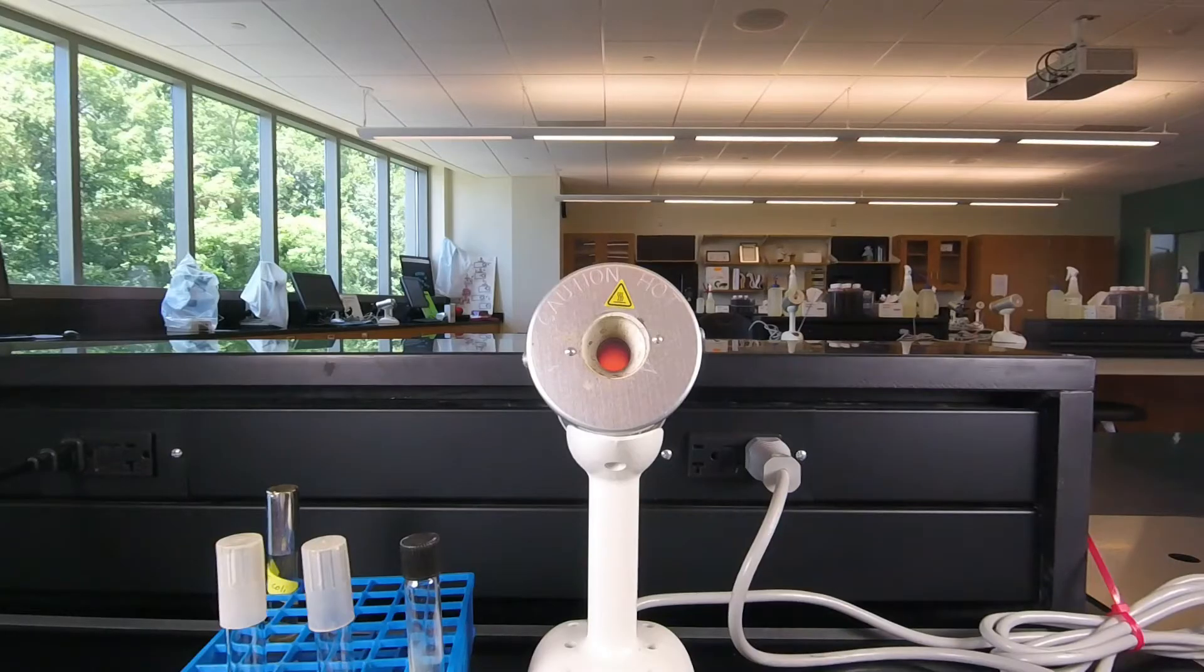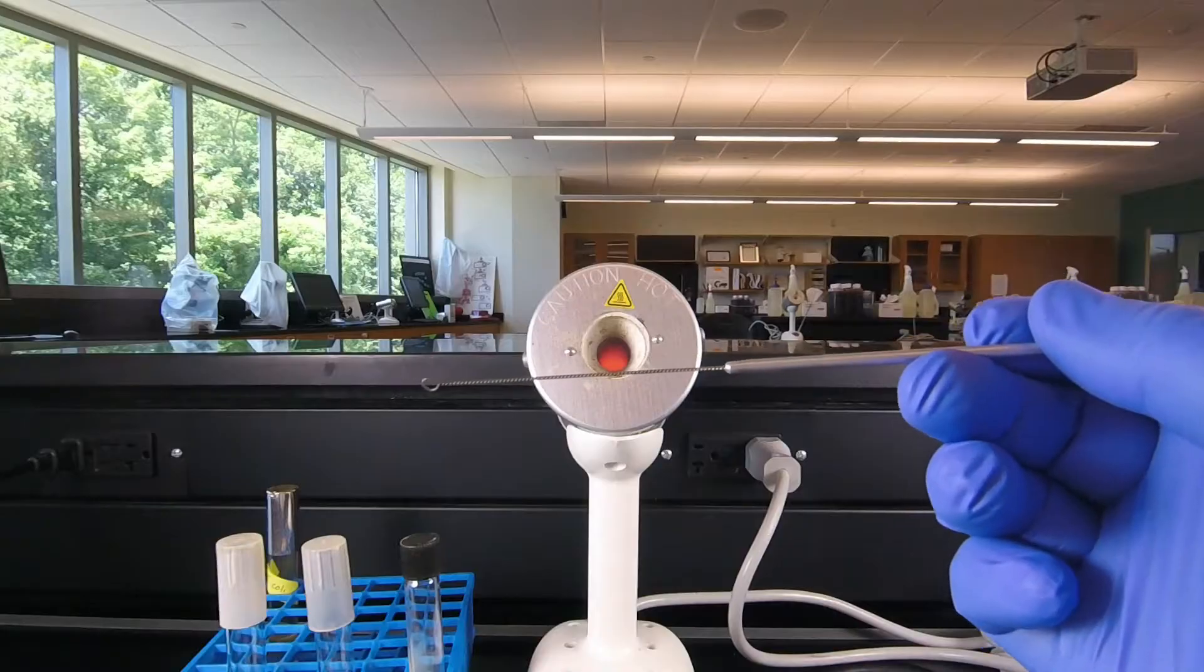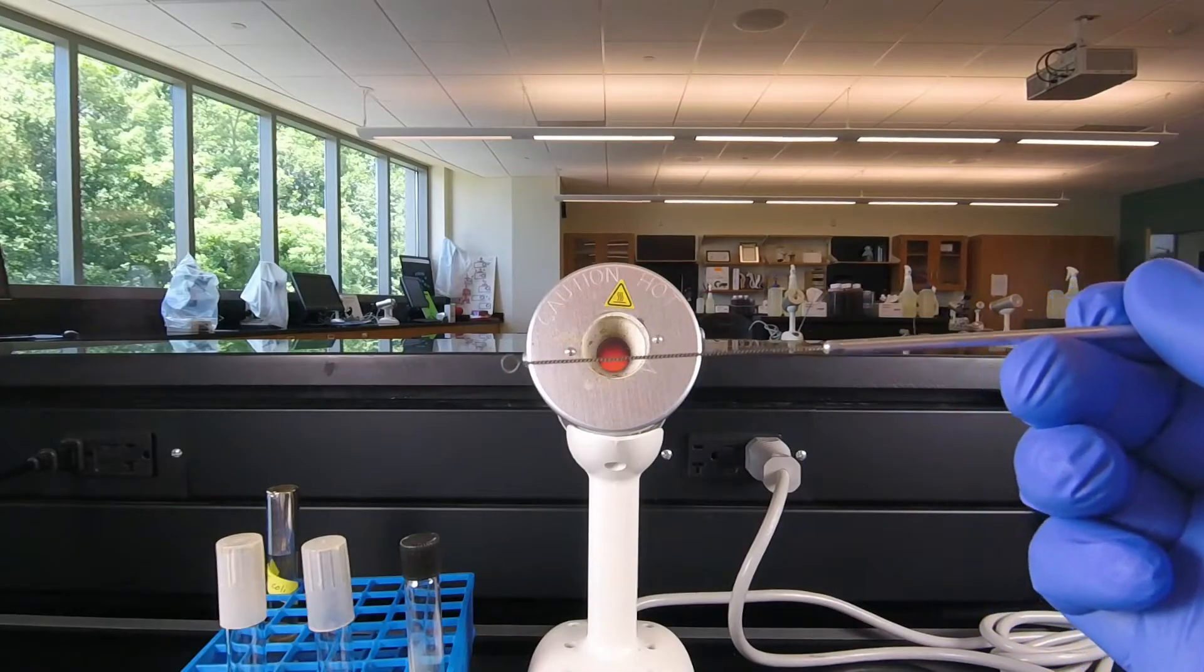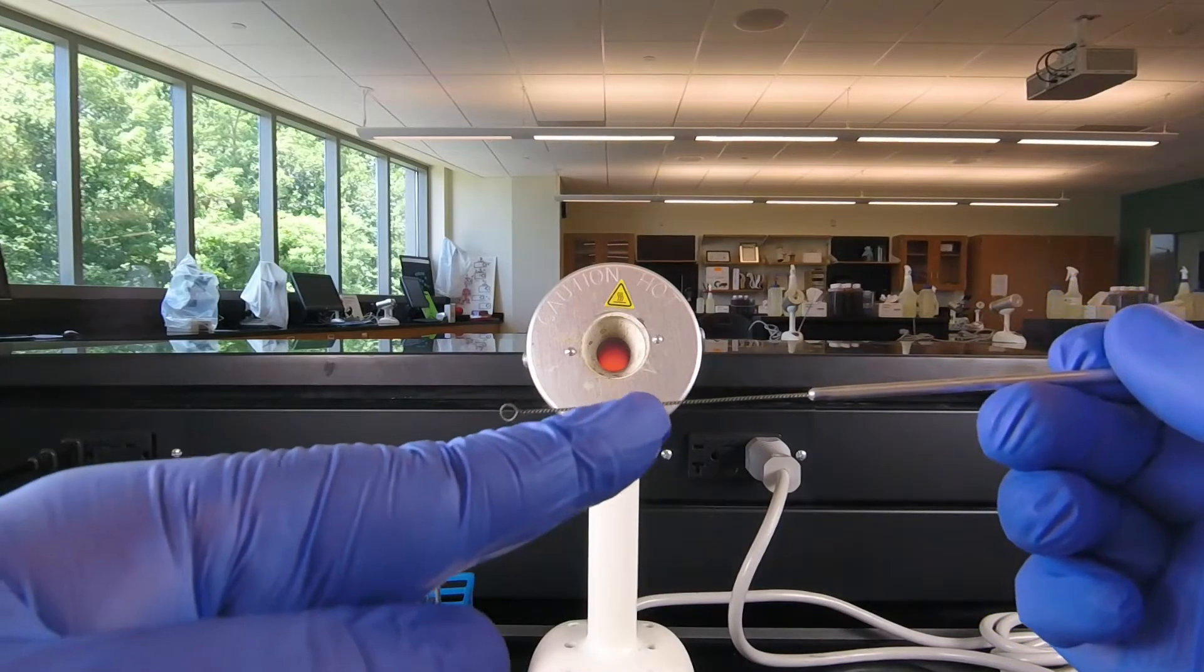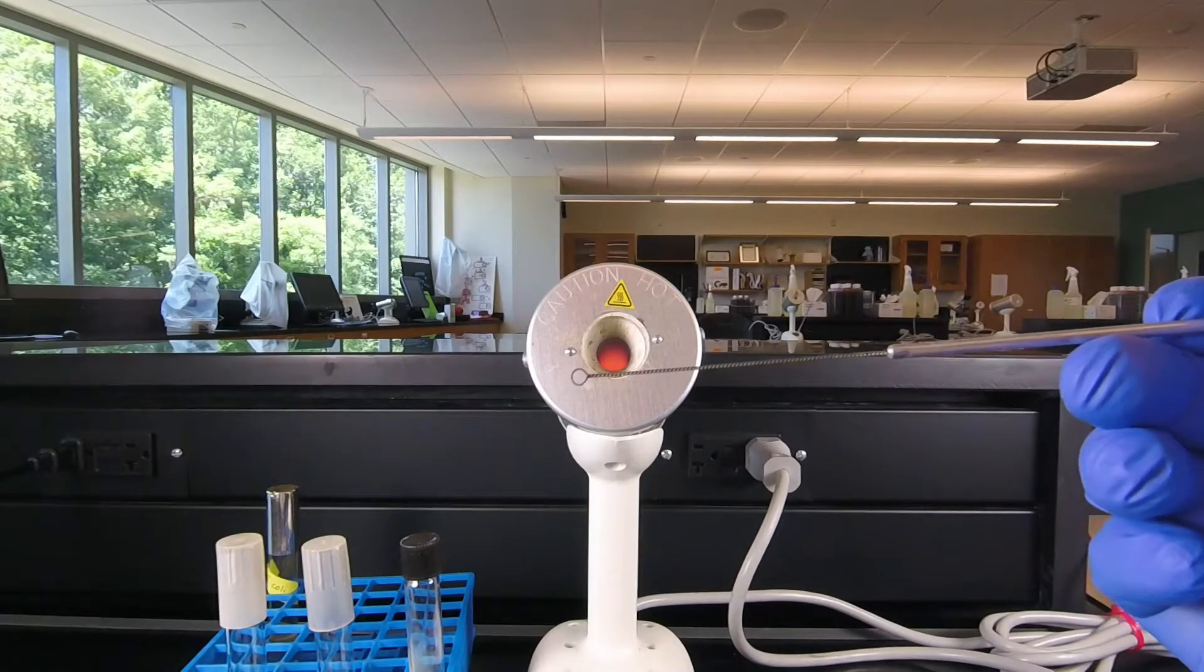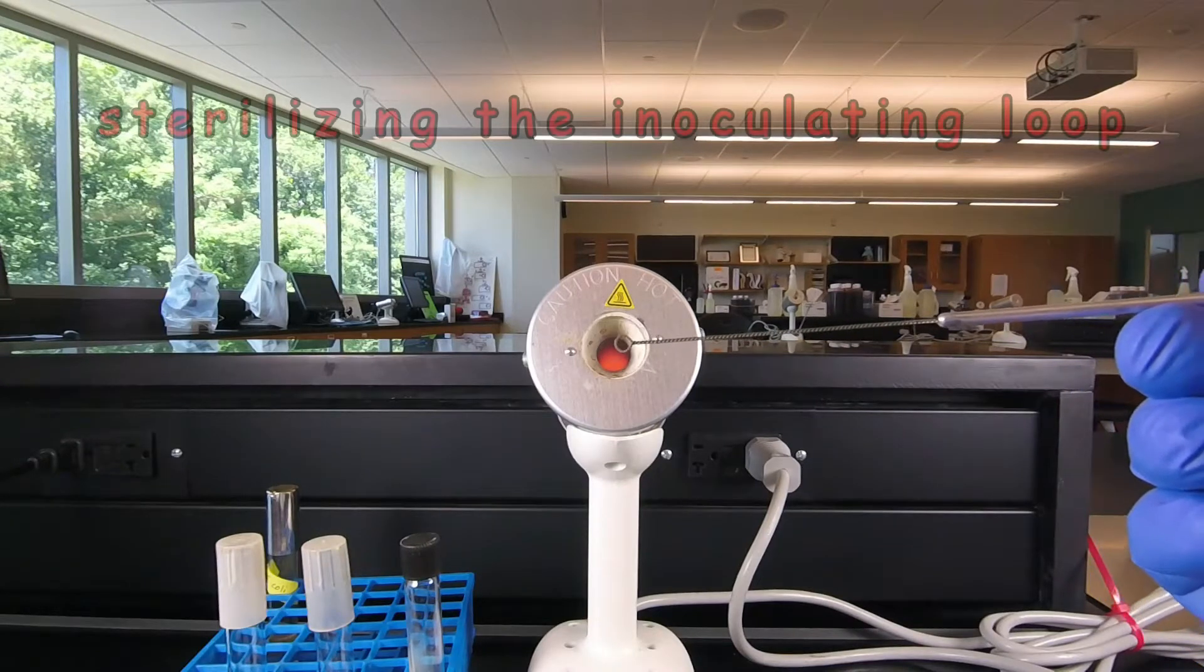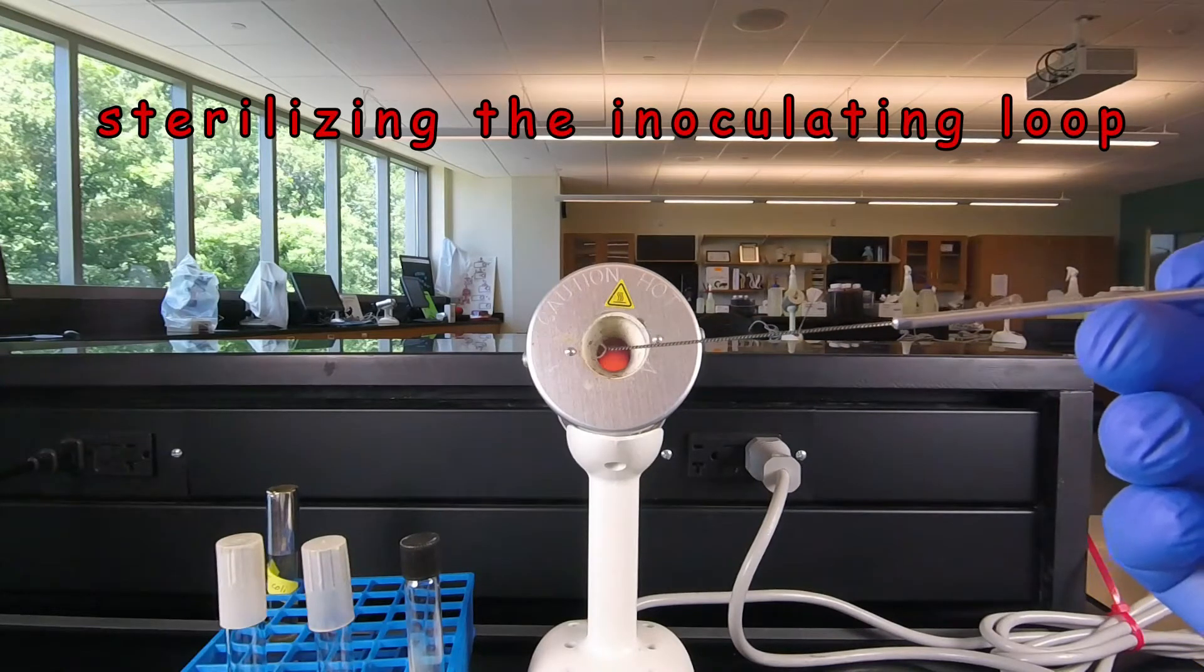Now for doing transfer we normally use a sterile inoculating loop and the inoculating loop is a handle that has a wire that terminates in a loop on the end. And before we can put that into any bacteria to remove them or to do any sterile transfers, we need to sterilize the loop.